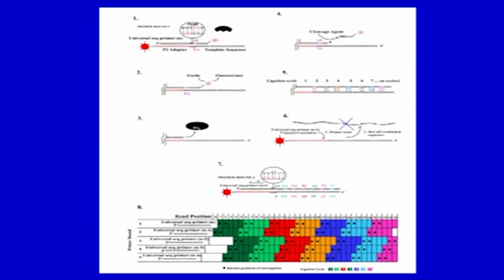Likewise, you will get sequence through priming and ligation, that is, each time these fragments of different types contain 2 bases. You can say these are dibase probes, and these are 6 to 8 bases long. When they are attached through ligation and finally removed, fluorescence can be read, and then these steps are repeated.